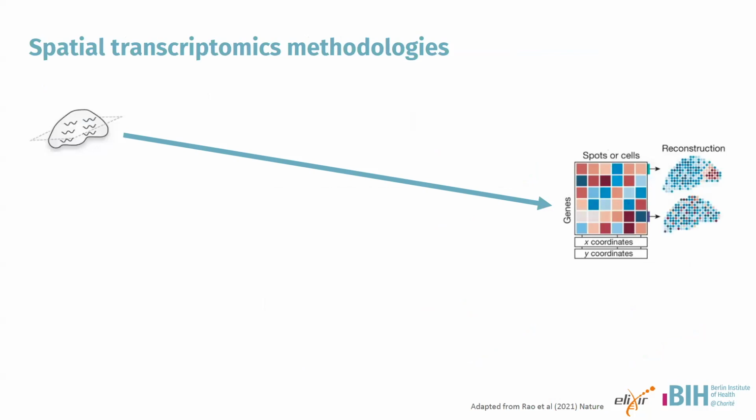But as a computational scientist, as a data analyst, essentially what you want to get to is this matrix at the end, right? For those that are doing single cell analysis, it's essentially the cell by gene matrix. And now with spatial data, we get those X and Y coordinates. So we can really see where those genes are expressed in our favorite tissues.